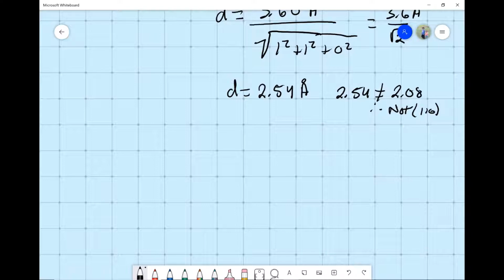If in fact it's not a first order reflection, you have a lot more calculations to do, and there's actually computer software that does stuff like this. But we're doing it by hand because we're warriors, we're metallurgists. Okay, warrior metallurgists, that's my new Netflix series.